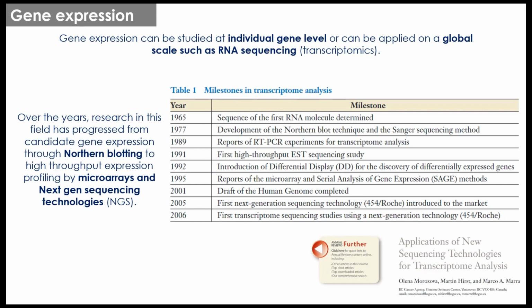was studied using a process called northern blotting. As many of you are already aware, when we talk about blotting, it means that your biomolecule is being transferred onto filter paper or a membrane, and then hybridized with a particular probe. Using this probe on the membrane, you use X-ray film to see how much expression has happened, right? Similar to how we do Western blot for protein or Southern blot for DNA.